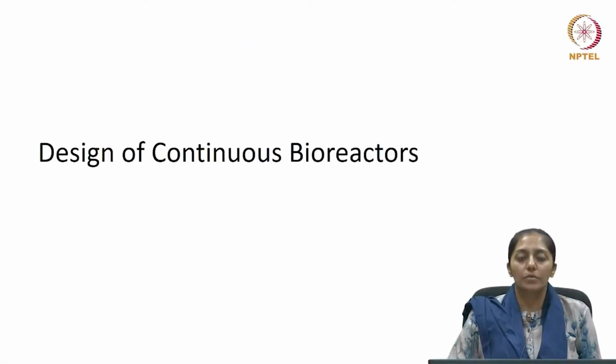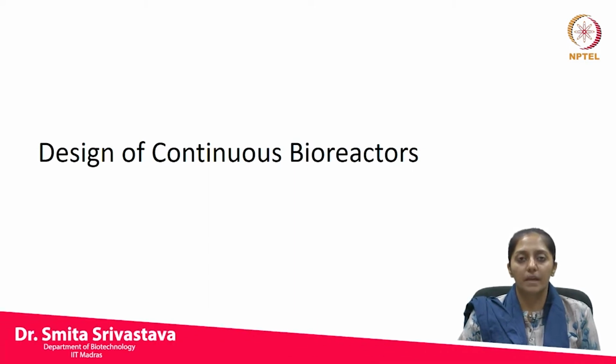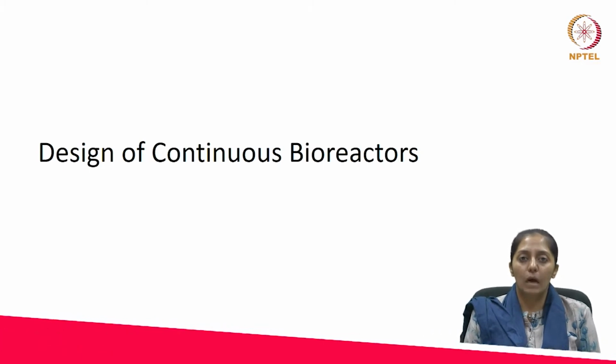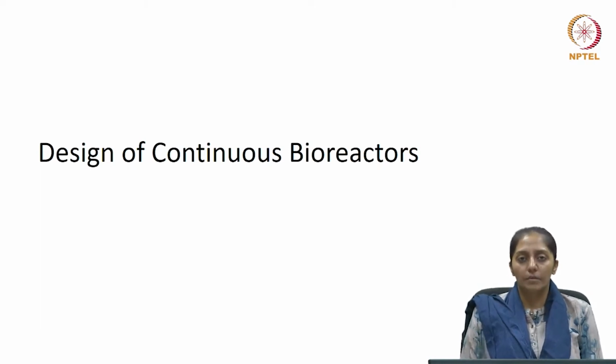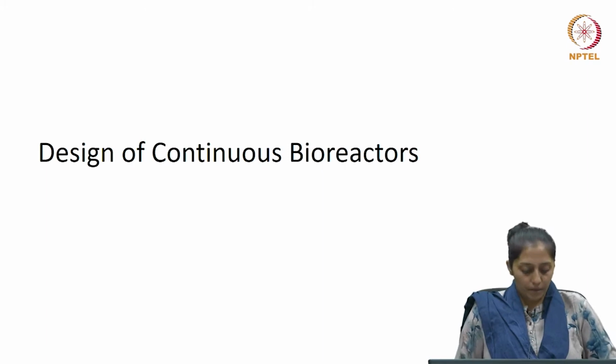Welcome back, students. So today we are going to talk about continuous bioreactors and their designing. So we have been able to now discuss what bioreactors are. Then we also discussed the design of batch bioreactors. Then further we discussed the design of fed batch bioreactors and the application of fed batch cultivations in the fermentation industry. And now today we are going to discuss continuous fermentations, their applications, and then the design of a continuous bioreactor.